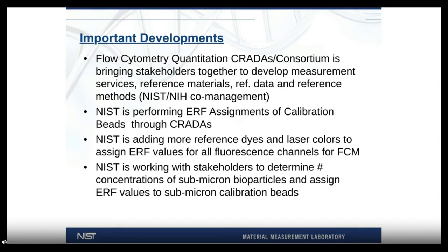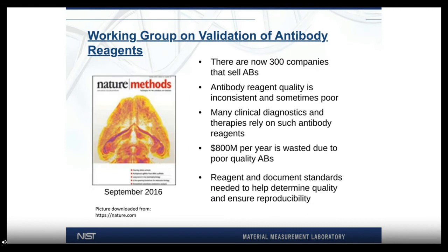NIST is performing ERF assignments of calibration beads through CRADAs. We're adding more reference dyes and laser colors to assign ERF values for all fluorescence channels that are available on all flow cytometers. That's our ultimate goal, with the ERF at least. We're also working with stakeholders to determine number concentrations of submicron bioparticles and assign ERF values to submicron calibration beads.